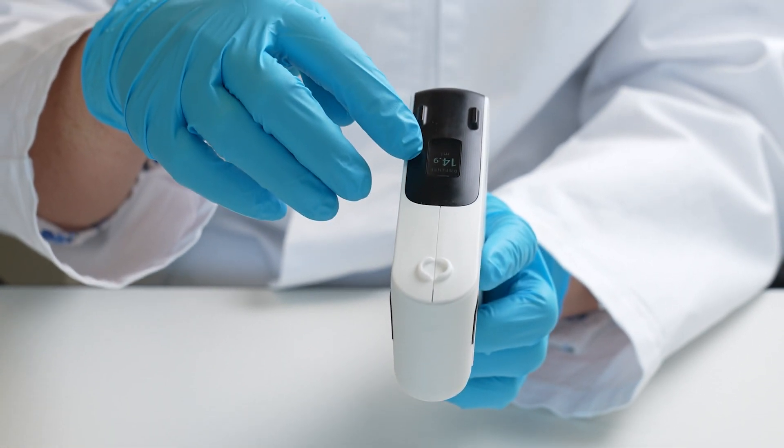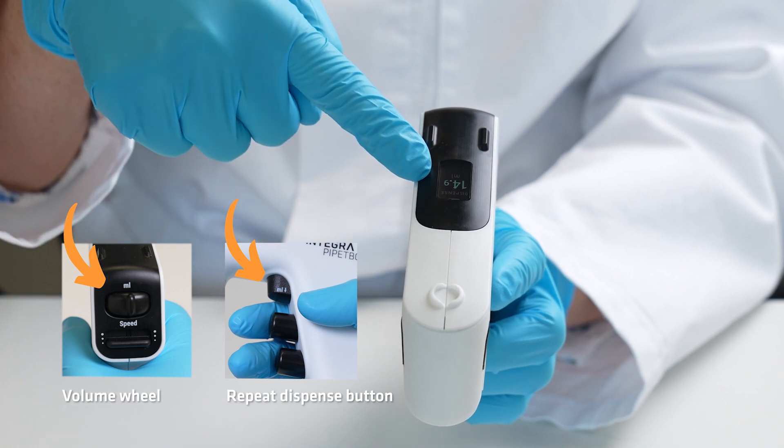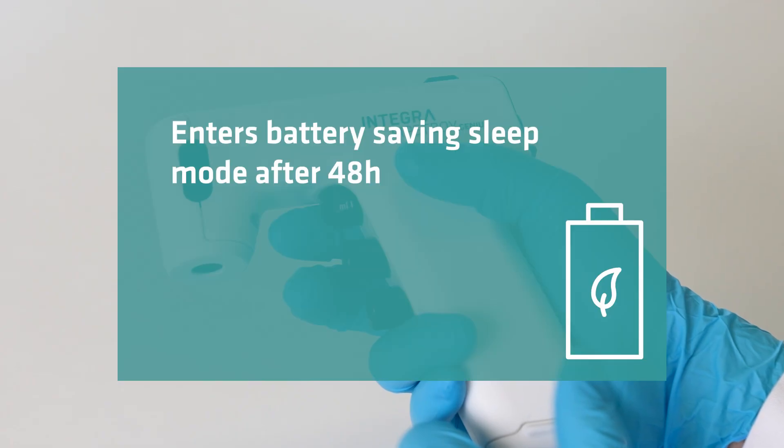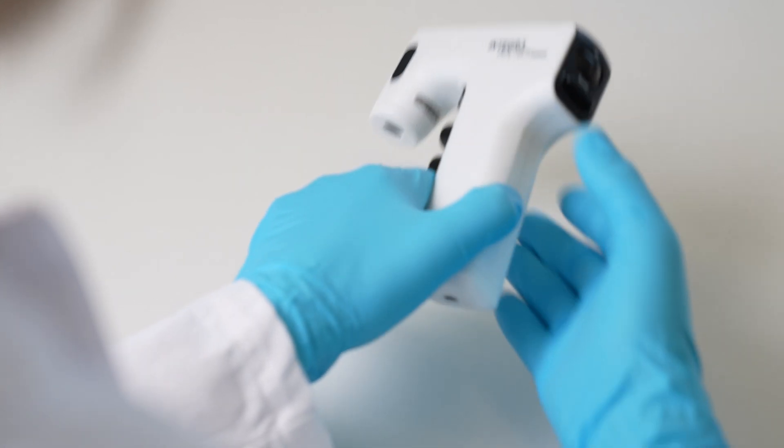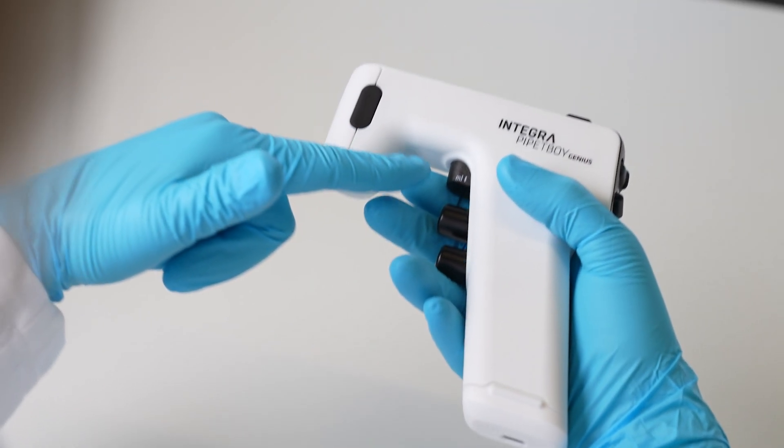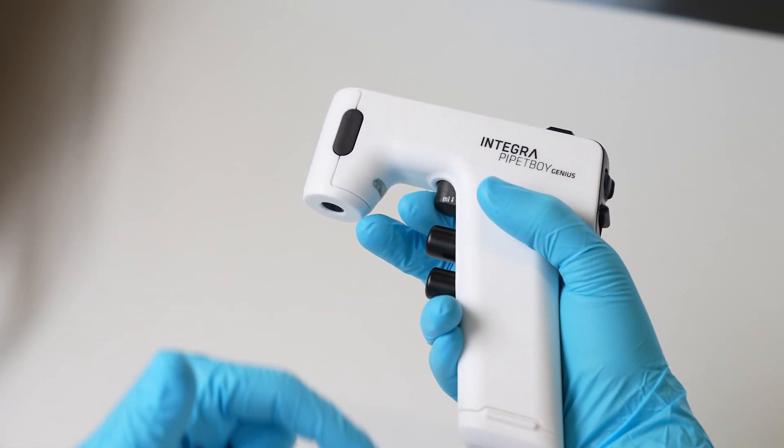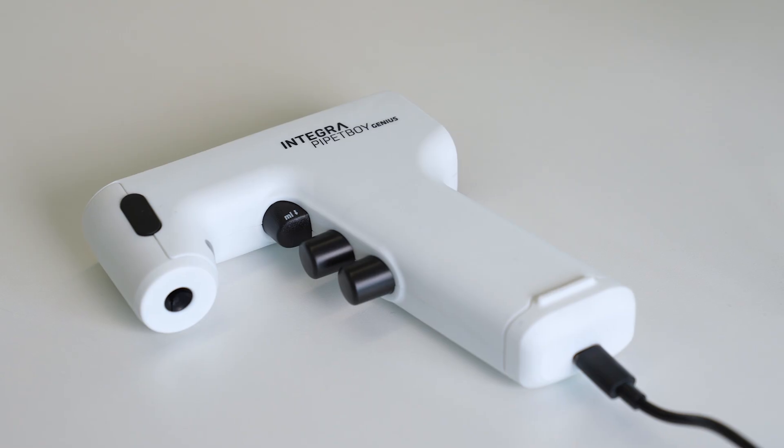Simply picking it up will switch it back on, as well as turning the volume wheel or pressing the repeat dispense button. However, if unused for over 48 hours or if switched off, the Pipette Boy Genius enters battery-saving sleep mode. To switch on again, simply press and hold the repeat dispense button for two seconds.